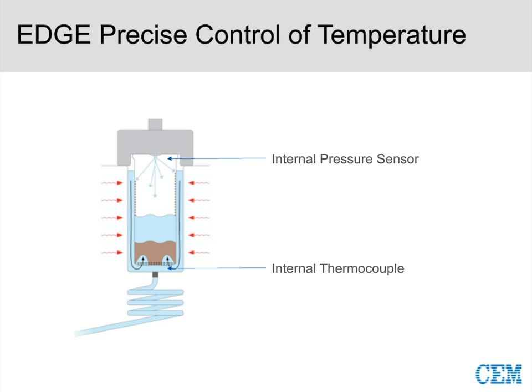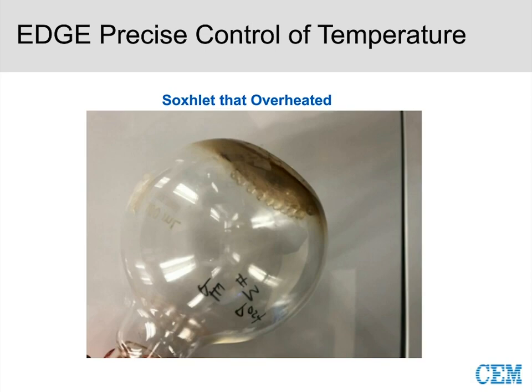With the EDGE, don't be worried about clogging — that's not going to happen because we're not going to have temperature issues. We know exactly what's going on in the cell. Even Soxhlet can easily have heating issues. What's pictured here is Soxhlet running in our lab — it overheated while we were running these experiments. With Soxhlet you have to babysit it, make sure everything's set up right. You don't have to babysit the EDGE — you're confident it will run with no concerns.